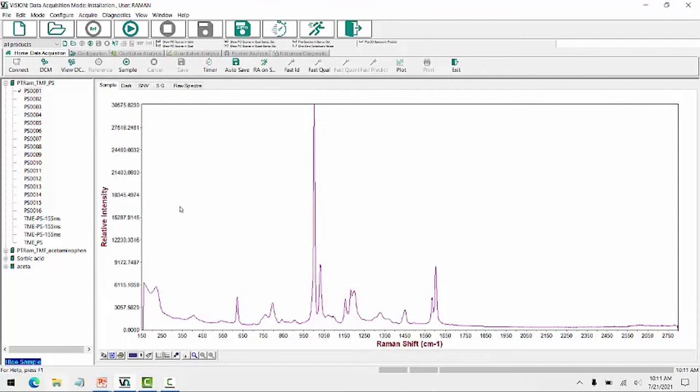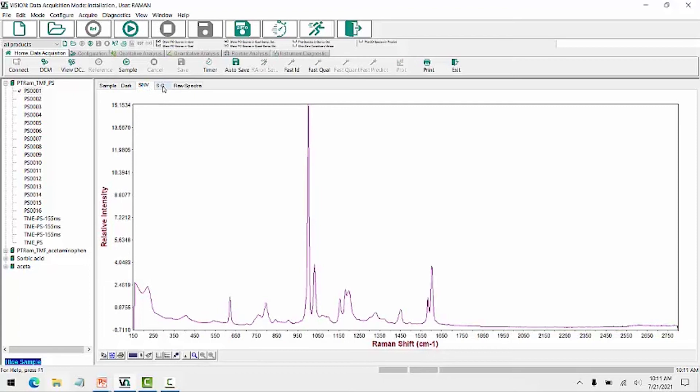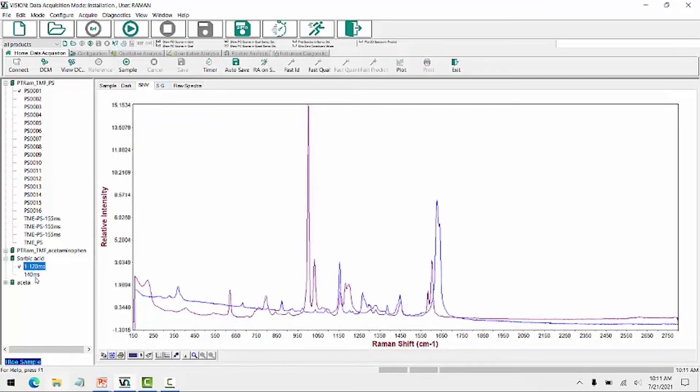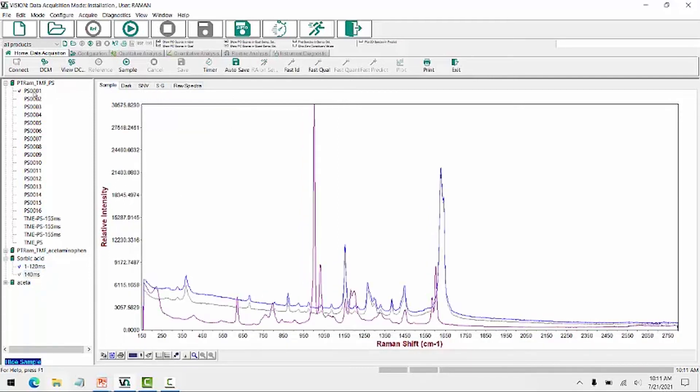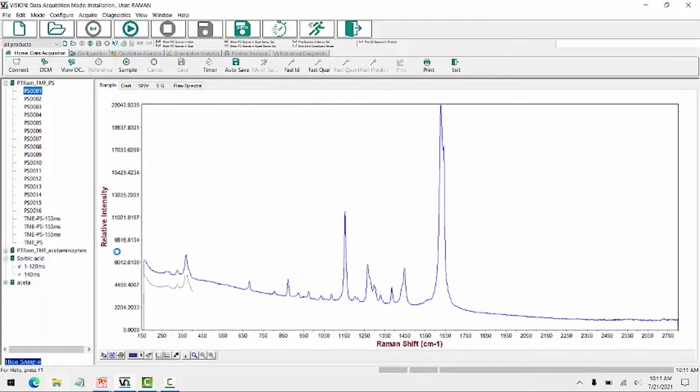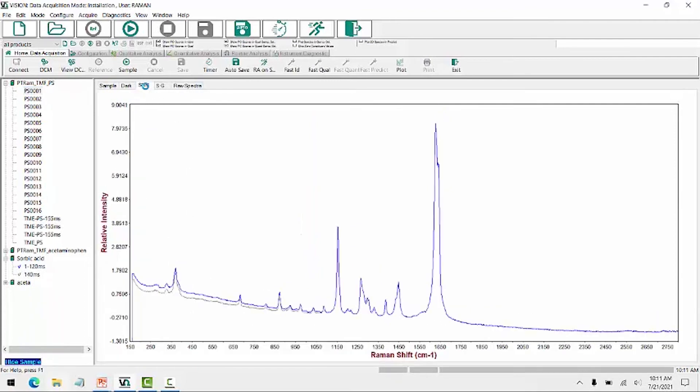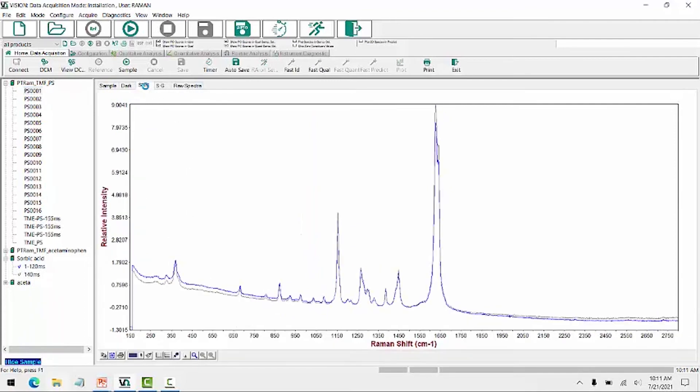When we look at Raman spectra, we often apply data preprocessing. And here I have standard normal variant and Savitzky-Golay processing selected. So we can actually overlay a few spectra here, where I have the same sample at two different integration times. Look at those as raw data. And we see when we look at the standardized, they are more closely overlaid with each other. We can also look at the derivatized data.